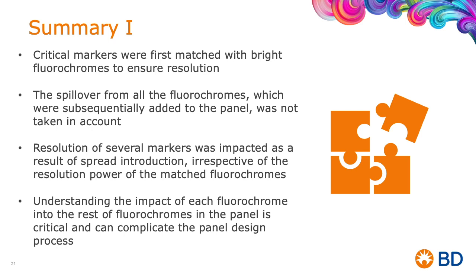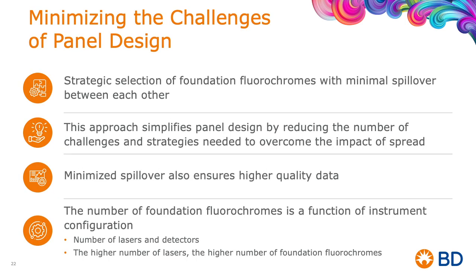And that's where panel design can become complicated and complex, because you need to be able to keep track of all the possible combinations. And that brings us to the last part of the webinar, the tools that we want to share with you to really minimize this challenge of panel design, and minimize the risk of making a wrong choice of fluorochrome that will have a significant impact on our biology.